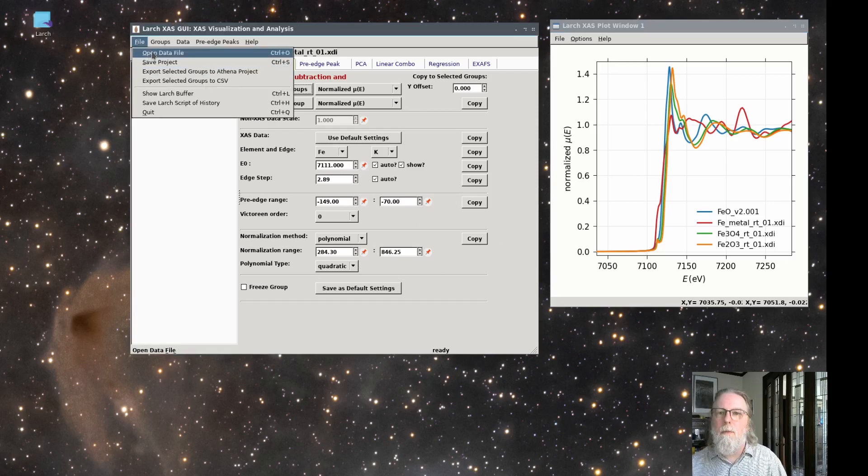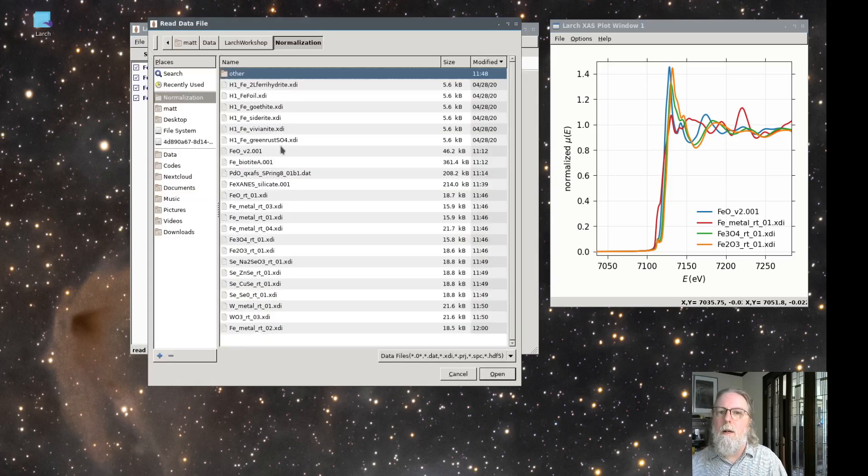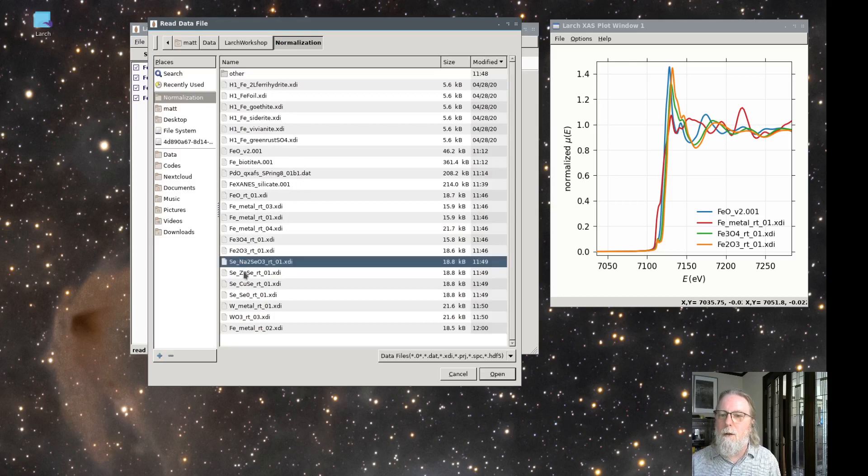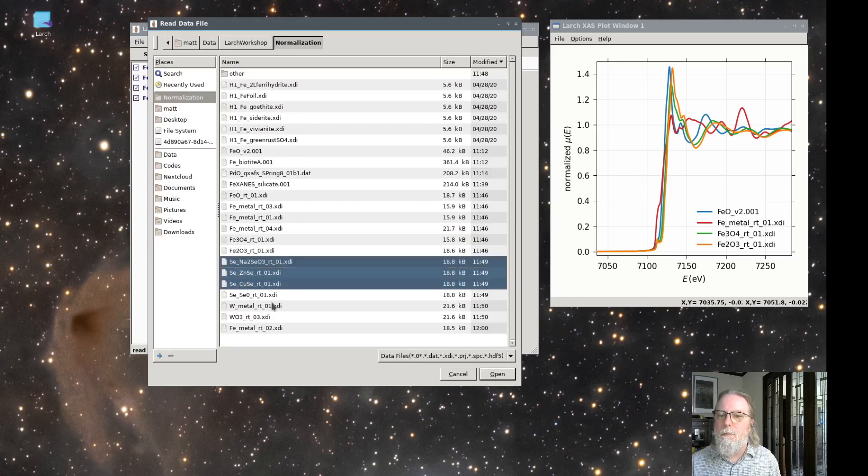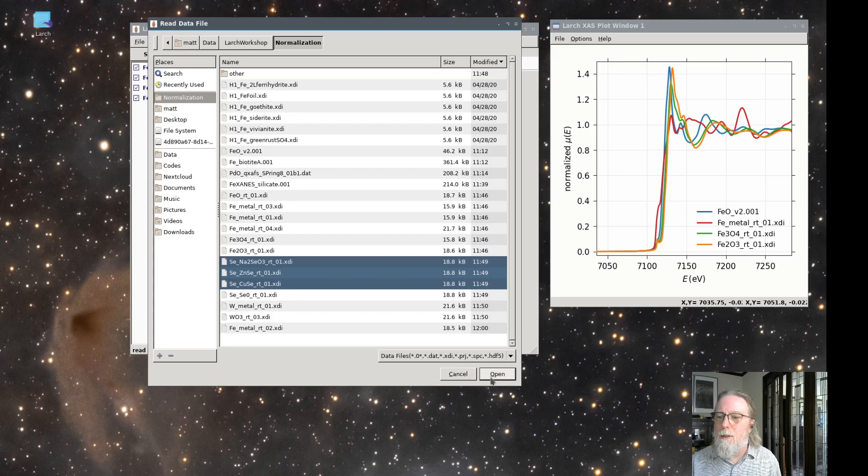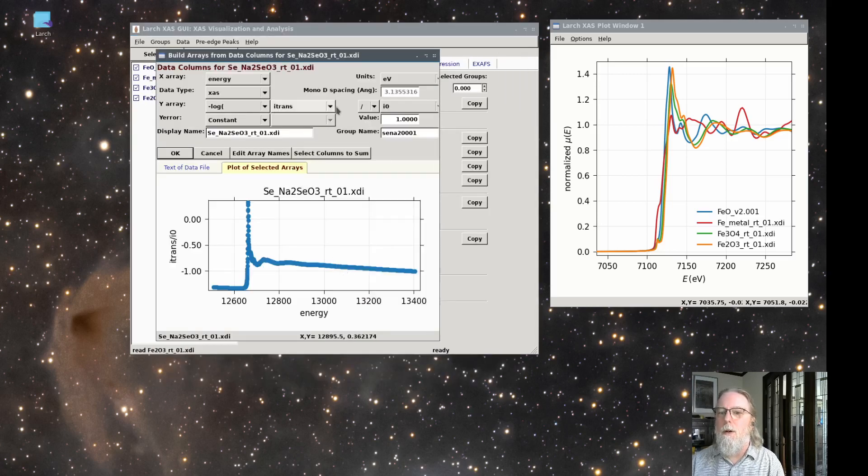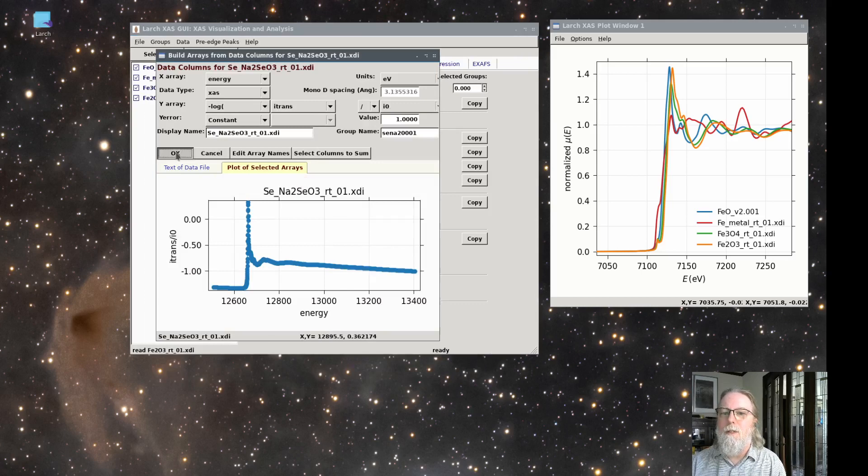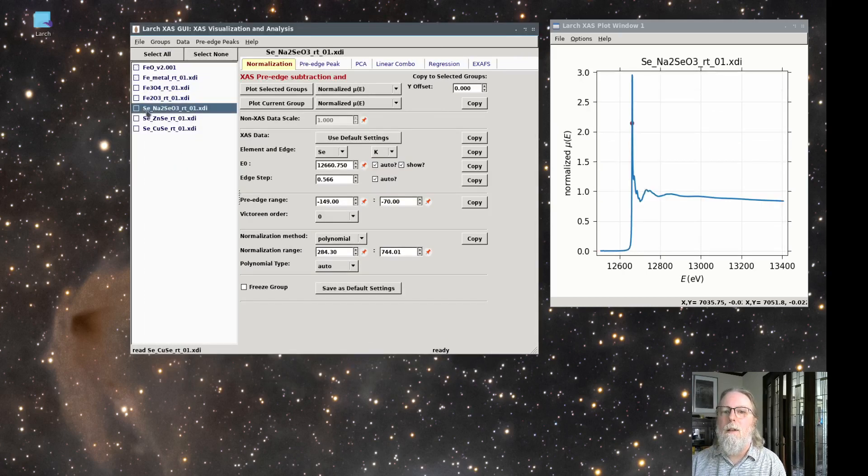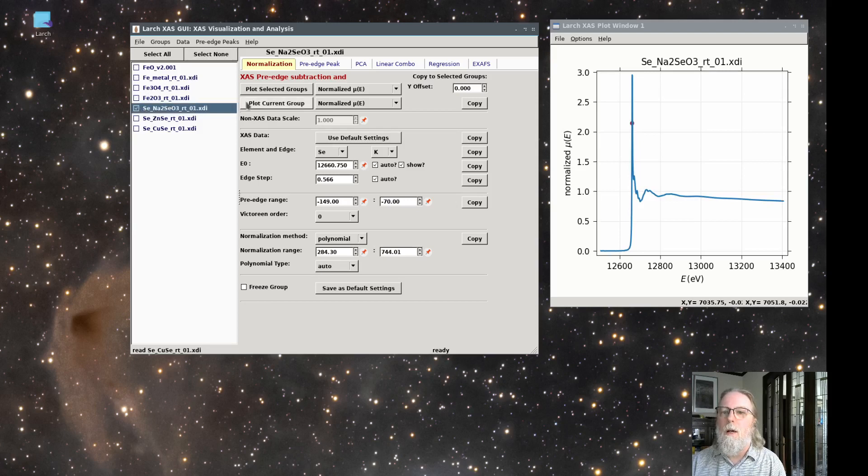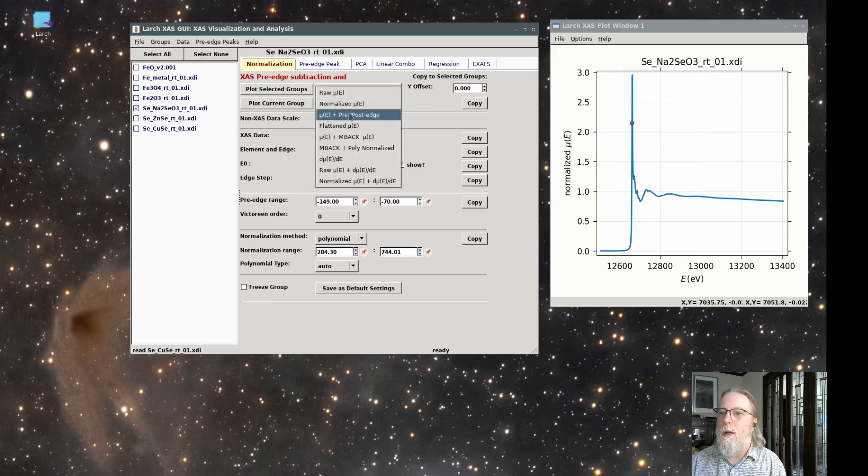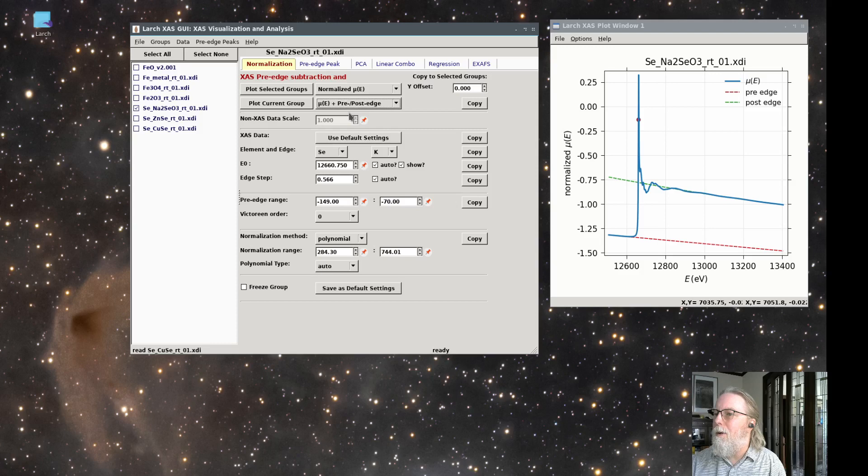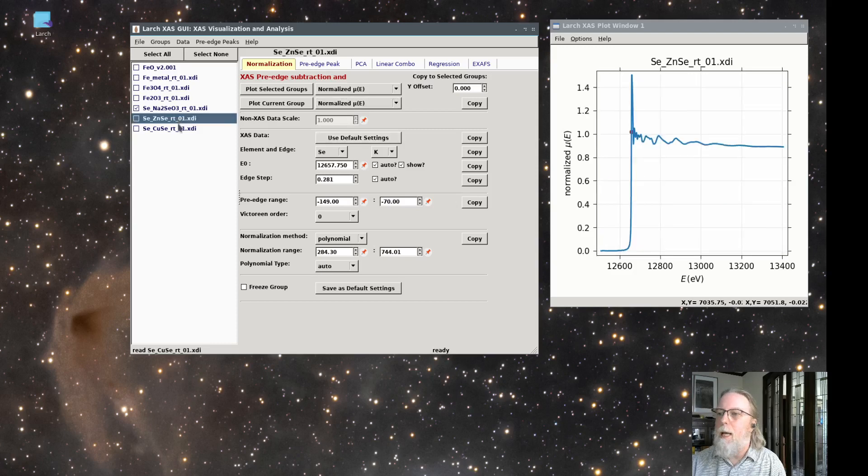Let's read in some other data from different edges, just to get an idea of how this might go for other edge data. I'll read in a pile of selenium data here, and make sure that these are all minus log of i trans over i zero. That looks good. Read in these sets of data. Let's go look at those. Again, using polynomial order, these all look like they're okay.